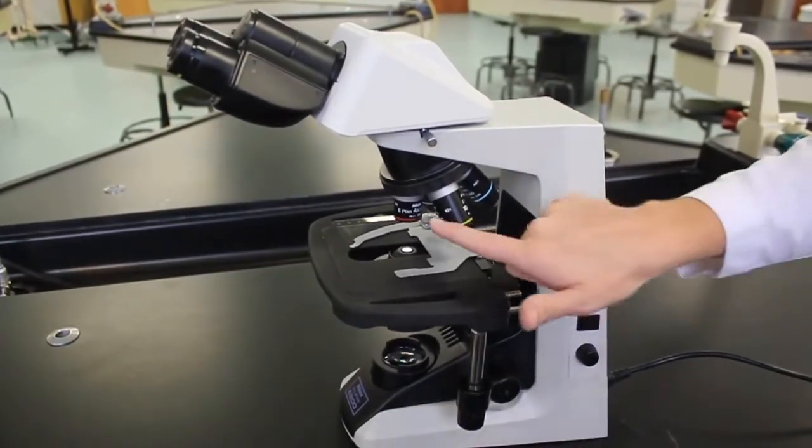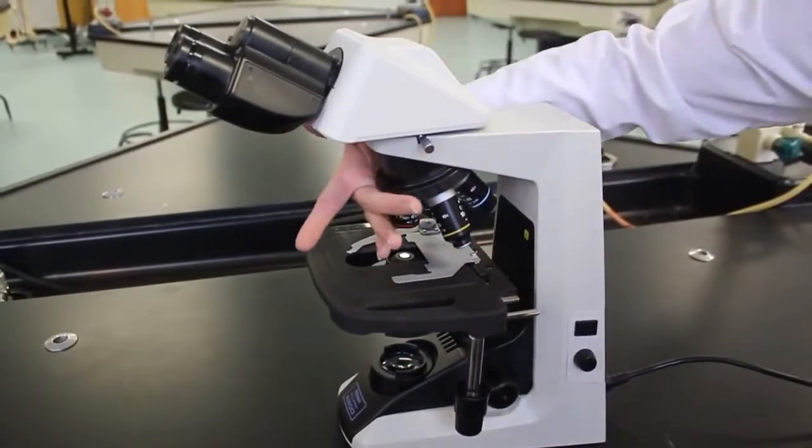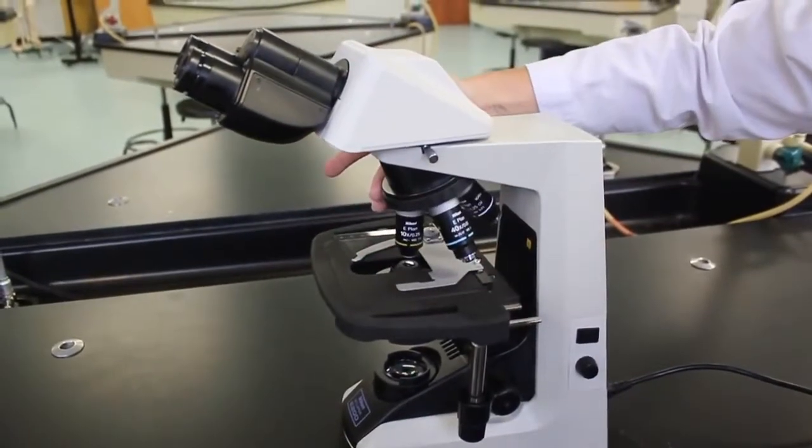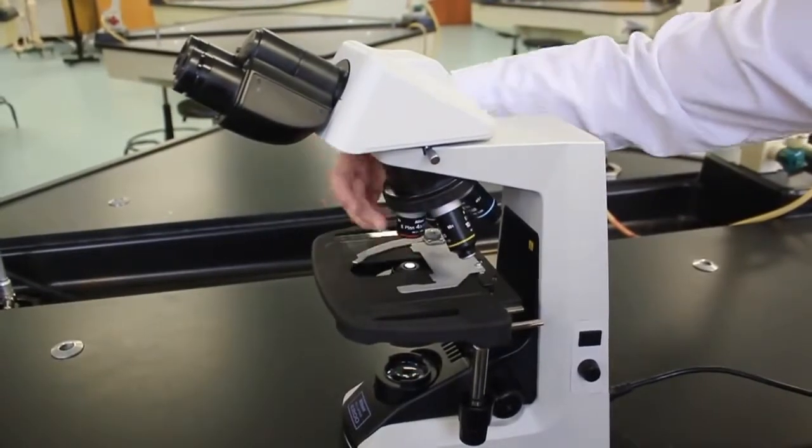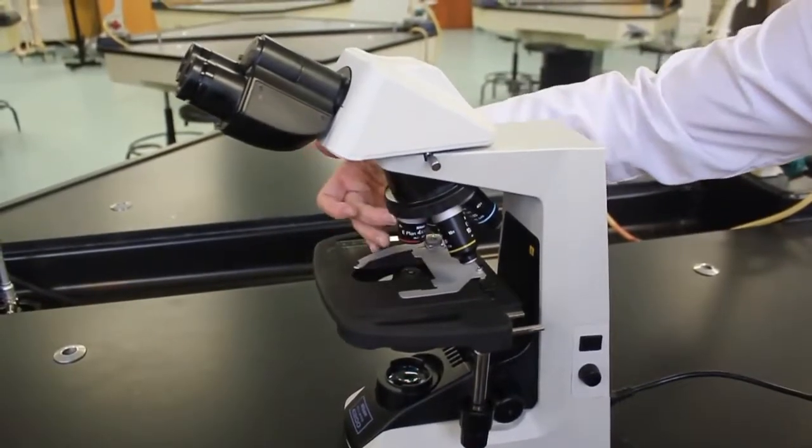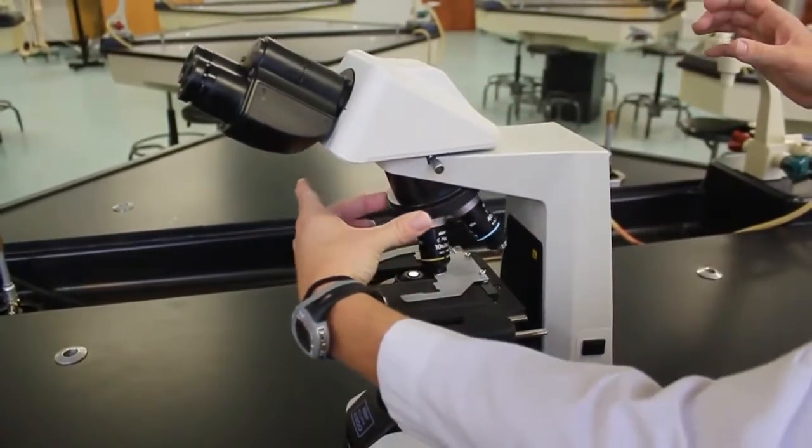When focusing the microscope, you always start with the scanning or 4x objective, then switch to the 10. Notice as I switched between objectives, I did not grab the objective to turn. You turn by grabbing the nose piece itself.